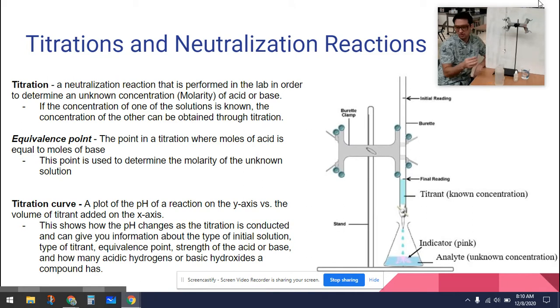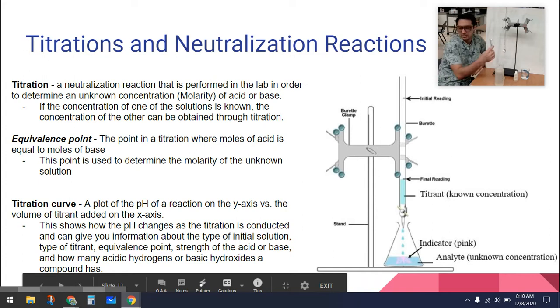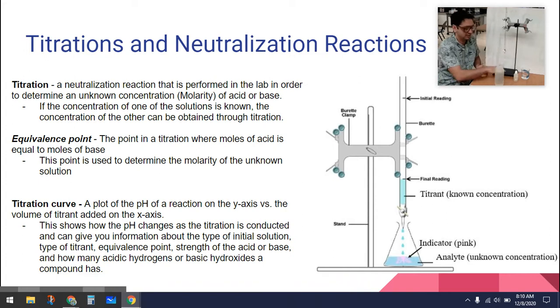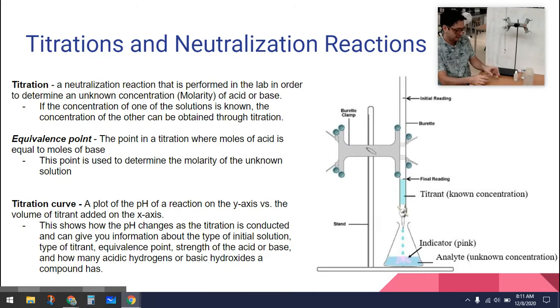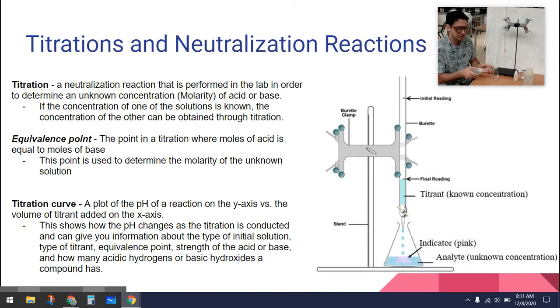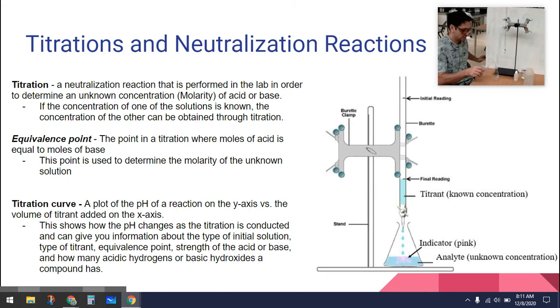So we're going to take a known volume of our unknown acid — we don't know the concentration of it. We take some of that and put it in an Erlenmeyer flask. Then we add a little bit of distilled water. Adding distilled water doesn't change the number of moles of acid, so we know we started with 10 milliliters. Adding a bit of water just makes the volume slightly larger and helps us see the color change better.